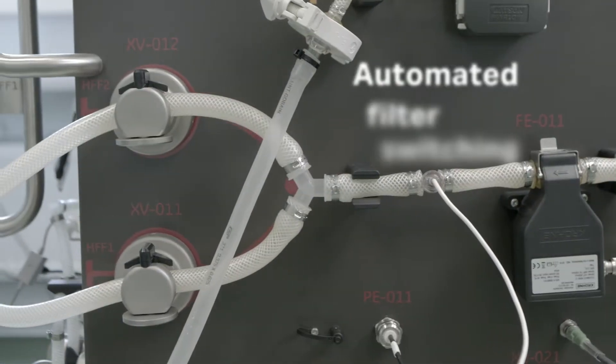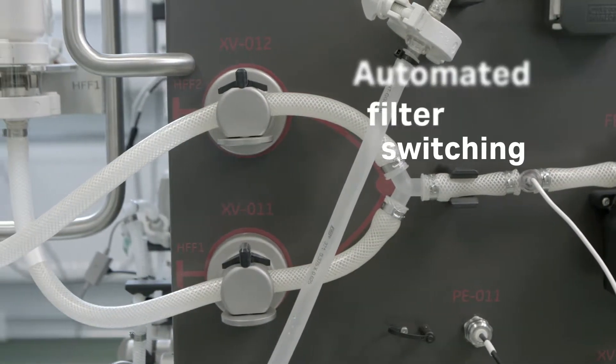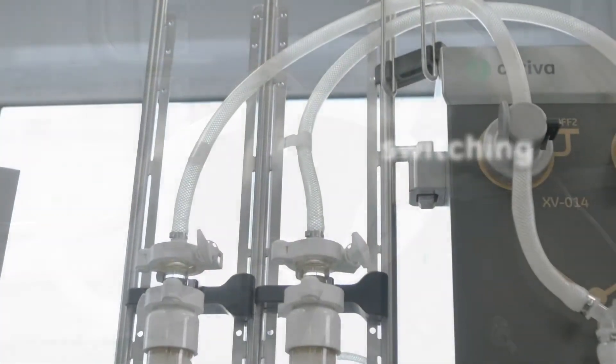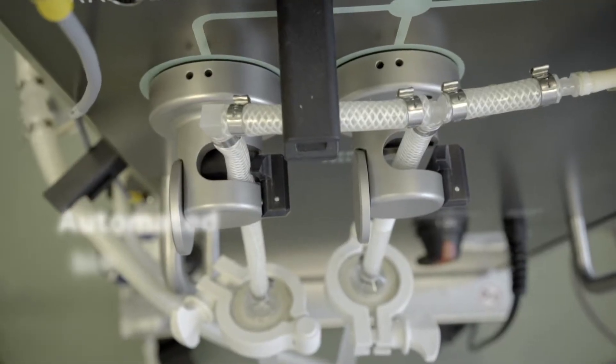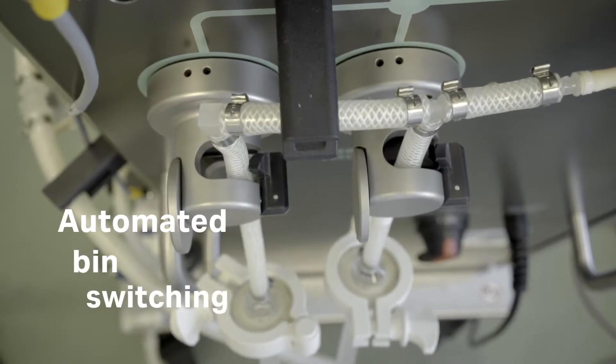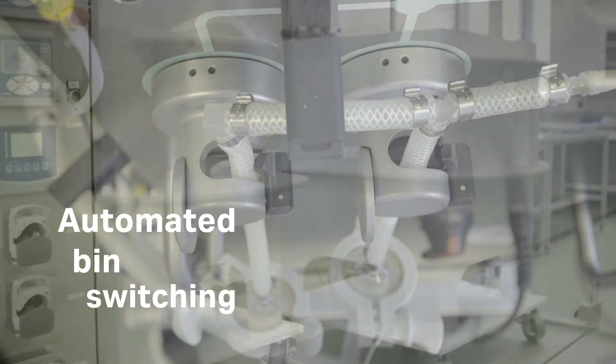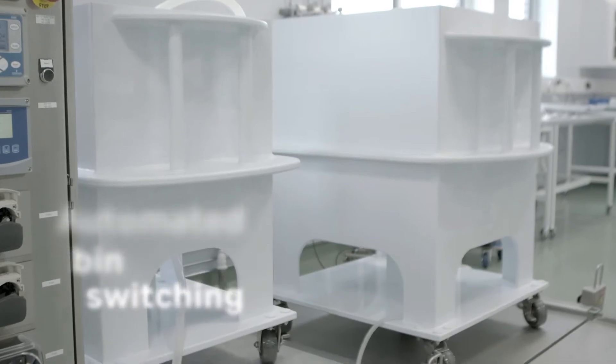The APS automatically switches from the primary to backup filter when needed, so you don't need a backup system. And it automatically switches permeate bins when full and media bins when empty to keep the system running smoothly and minimize hands-on time.